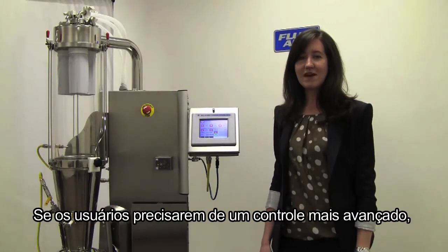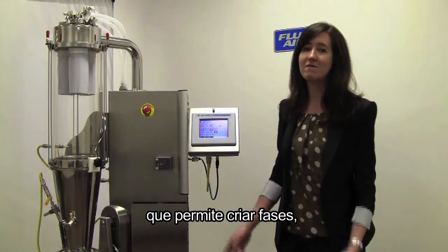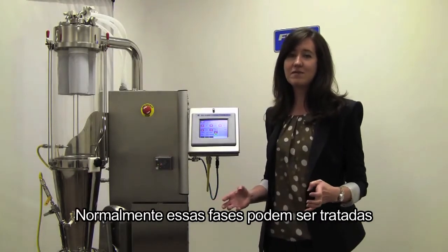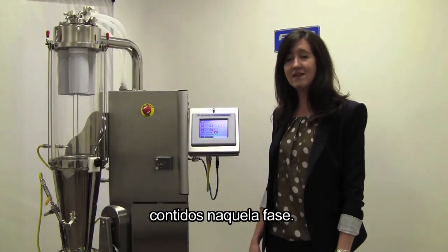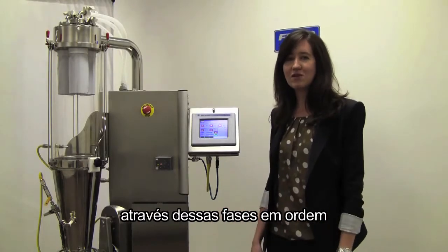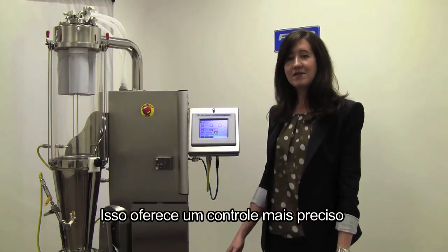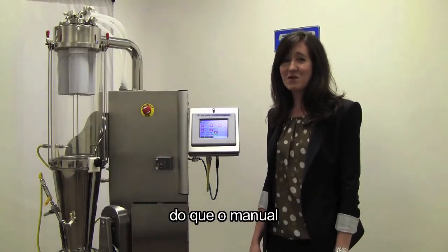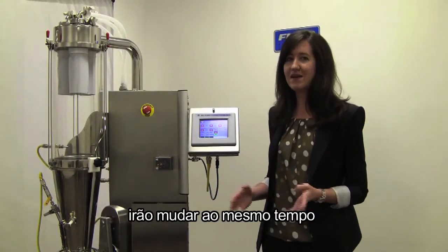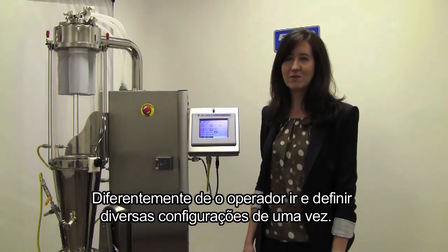If users need more advanced control, they can choose our phase option, which allows them to create phases which represent steps in the process. Each of these phases can be queued up to begin and set the parameters contained in that phase. The system will then proceed through those phases in order and control the system as it's programmed. This offers more precise control than manual control because all of the operating set points will change at the same time as it proceeds between phases, as opposed to the operator going in and setting several set points at once.